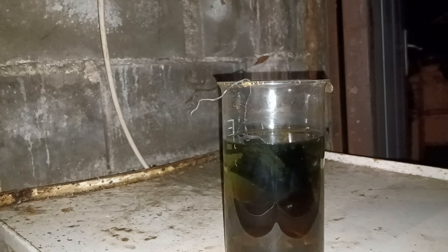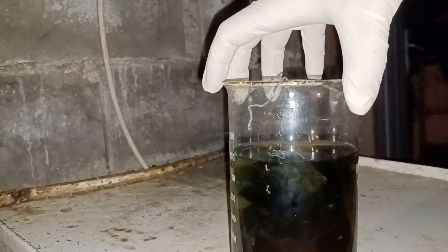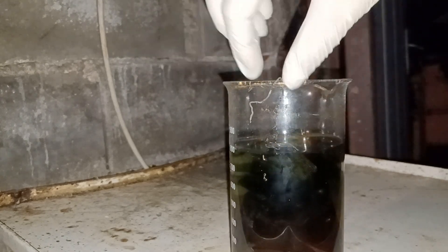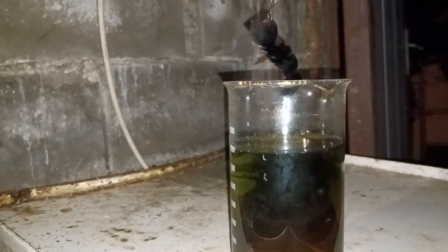Hello there. This video is a continuation of an extraction of palladium from e-waste. Last week I dissolved 206 grams of cemented silver and separated silver ions from palladium and any impurities that were present.